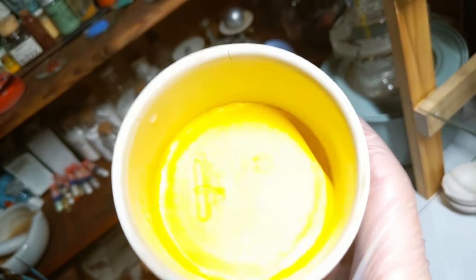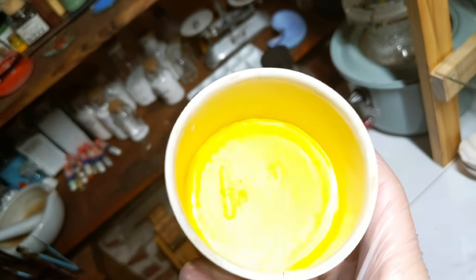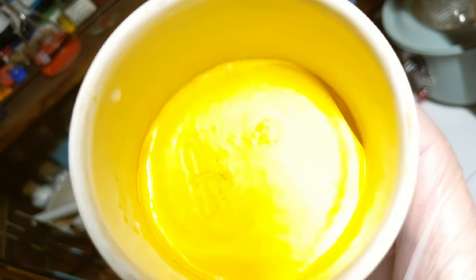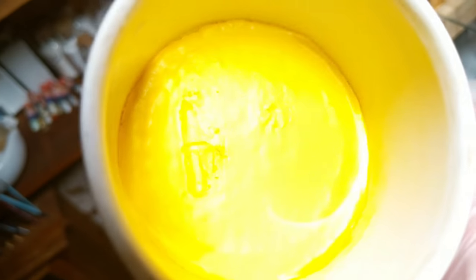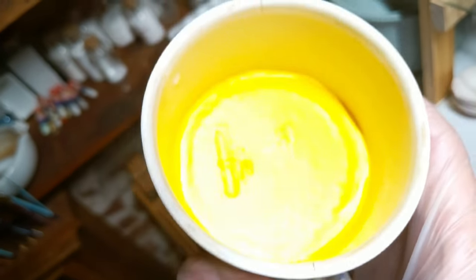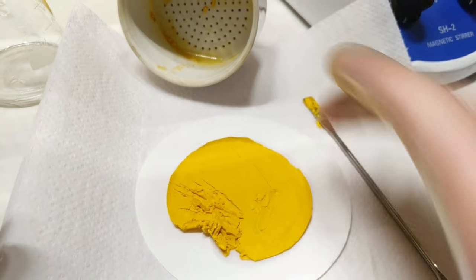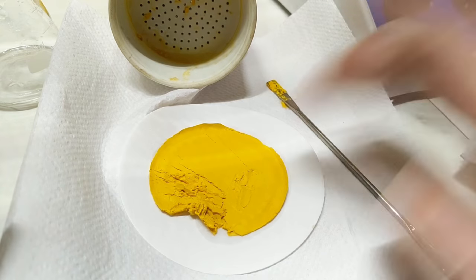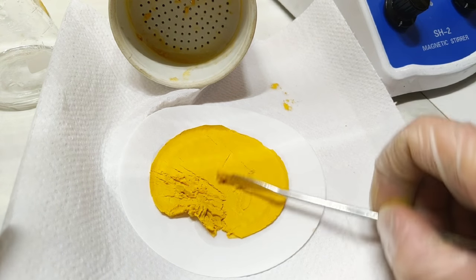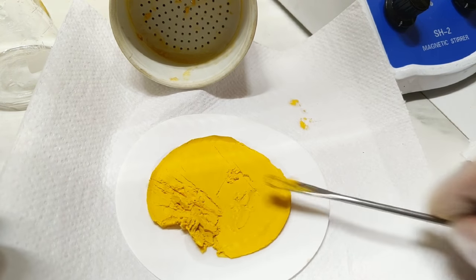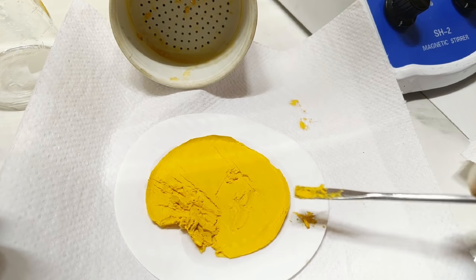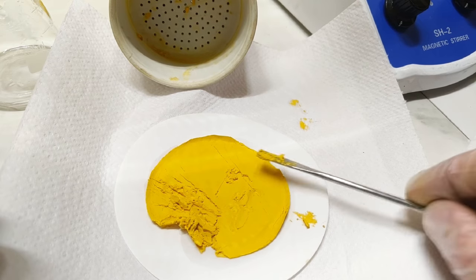Here we can see after running it through the vacuum filter, it seems to have dried up a fair bit. It's kind of hard to see, but you can see that the pigment is far from dry, but it's definitely dried out a lot. So that's the little cake of pigment after it's come out, which I'm just going to leave here on this piece of filter paper until it's dry, and then process it up from there.